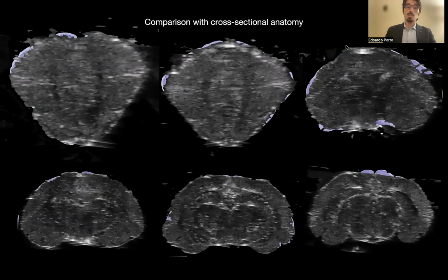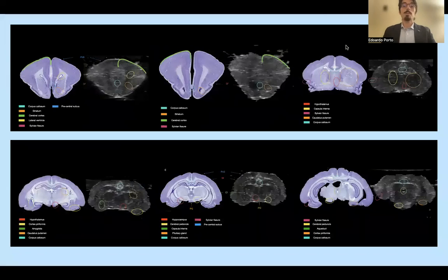Nevertheless, these images, both histological and ultrasonography images, were capable of showing some anatomical structures which were labeled in this project based on the available literature, which unfortunately is based just on hand-drawn atlases of the brainstem and the guinea pig supratentorial structures. So we were able to identify some cortical, subcortical structures, as well as structures of the basal ganglia.